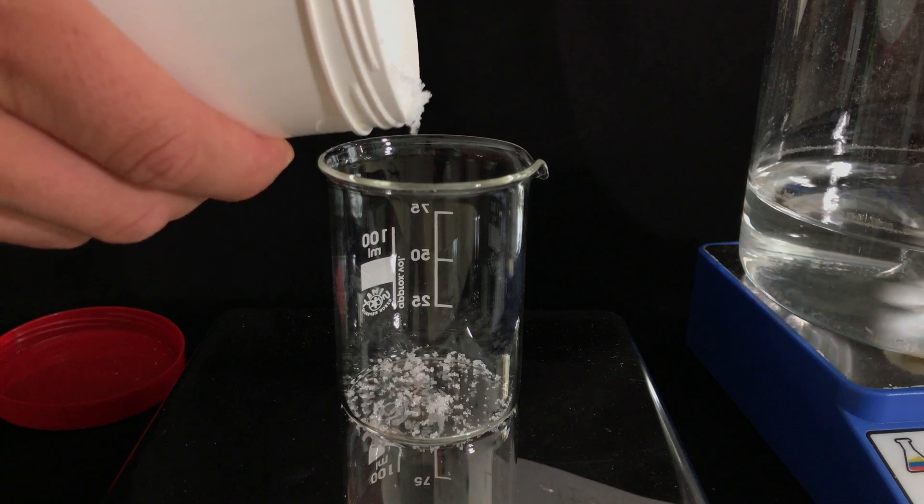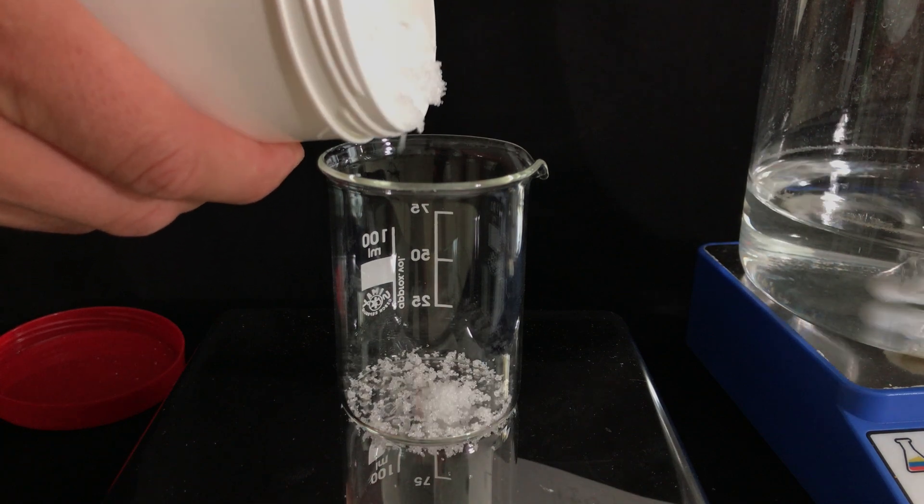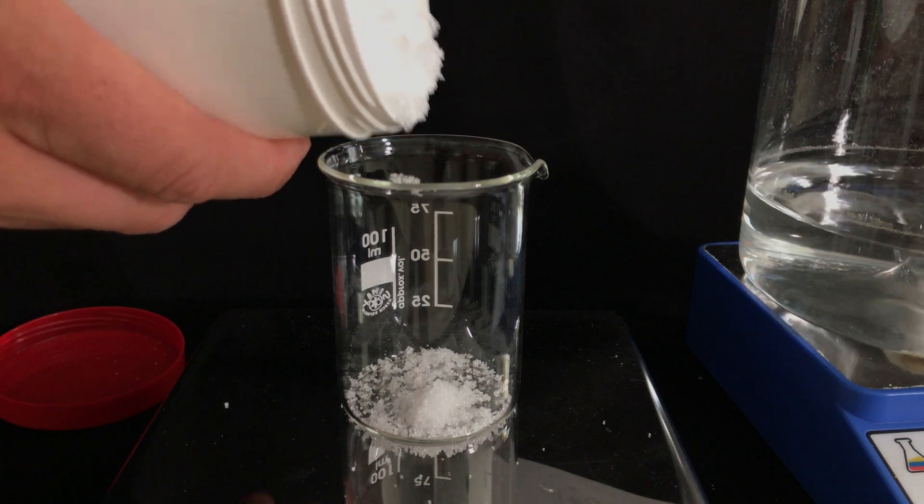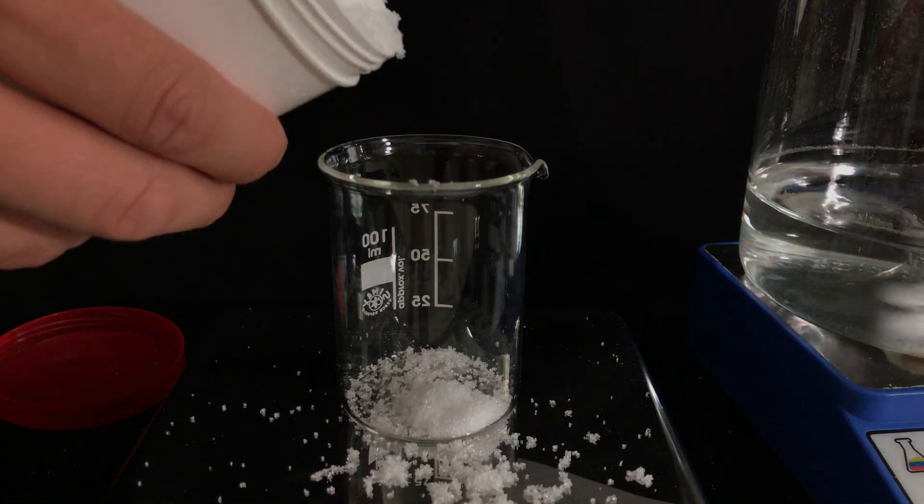Ammonium thiocyanate is highly soluble in water and therefore we won't have the same problem as with mercuric chloride. I spilled some, but fortunately it's not very toxic.